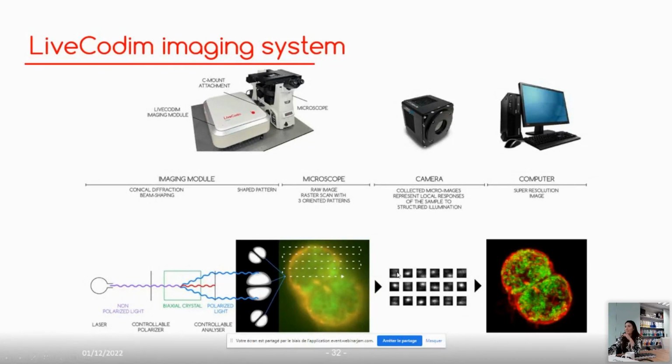We directly sample pixel by pixel locally, like exactly locally, how each distribution interacts with each part of the sample. And from there, since we're taking information from a camera, we can extract the higher spatial frequency information using maximum likelihood algorithms and produce a super resolved image.